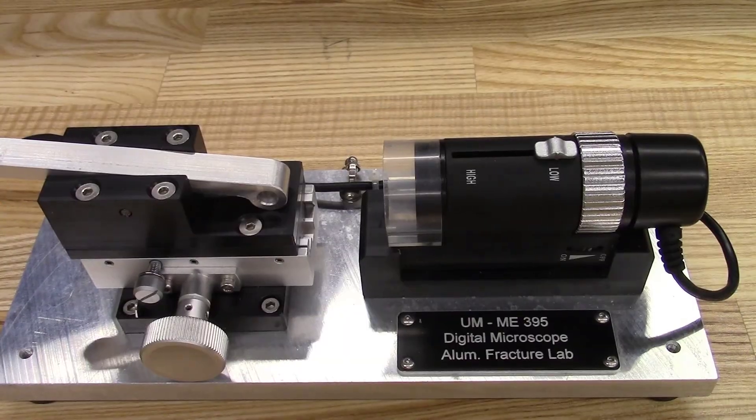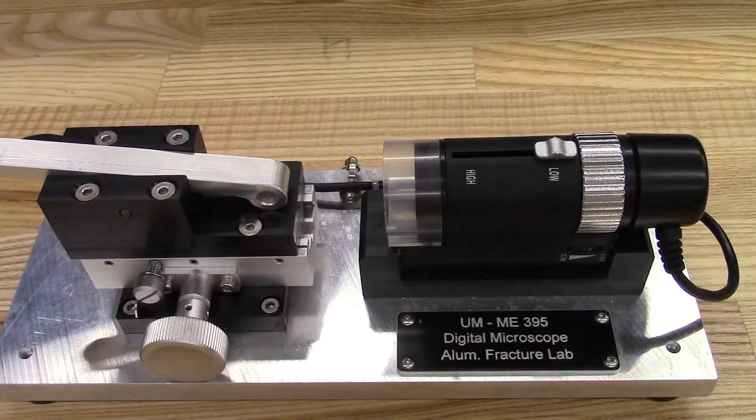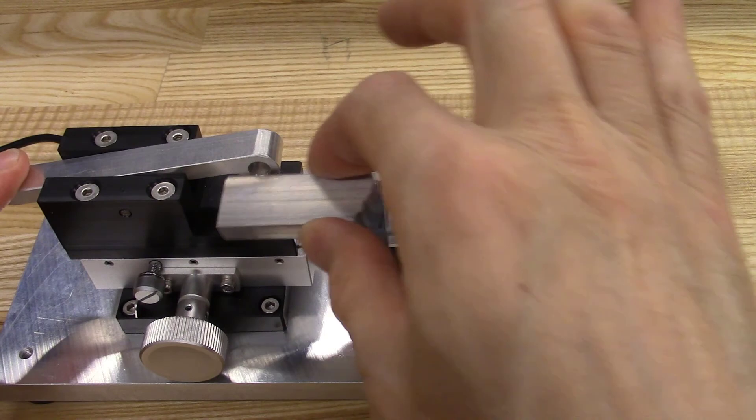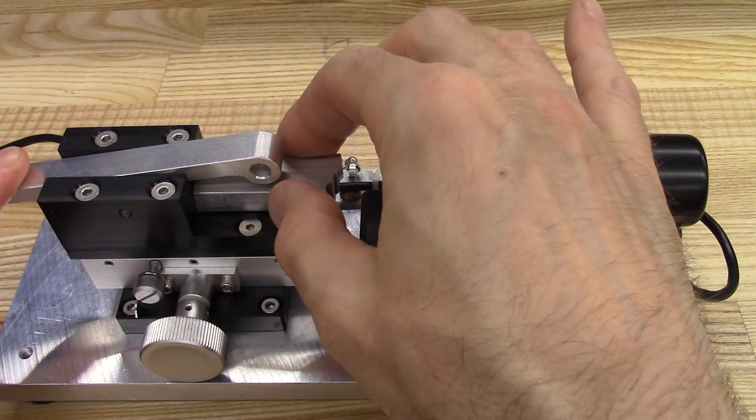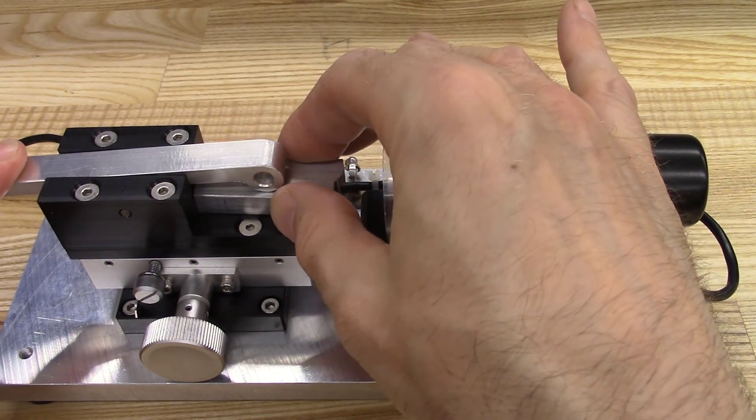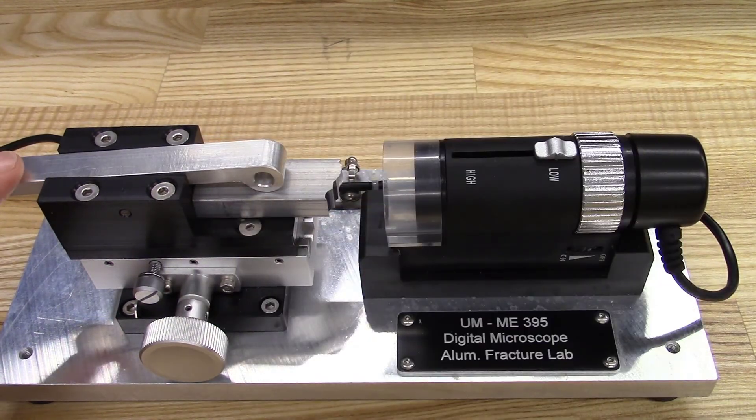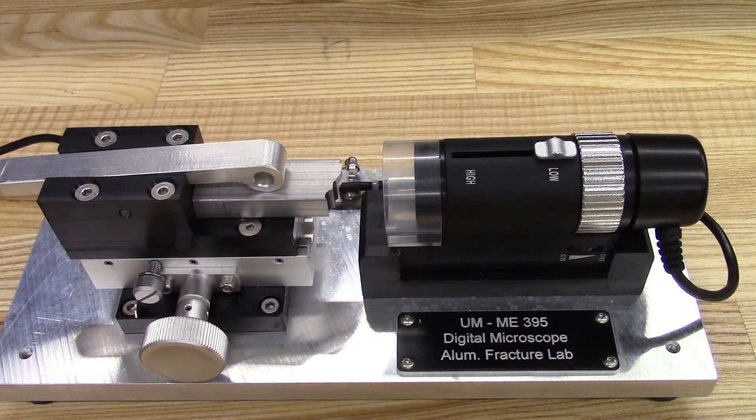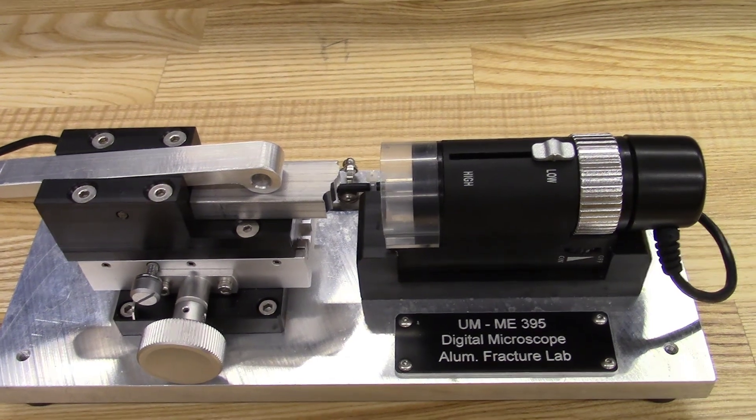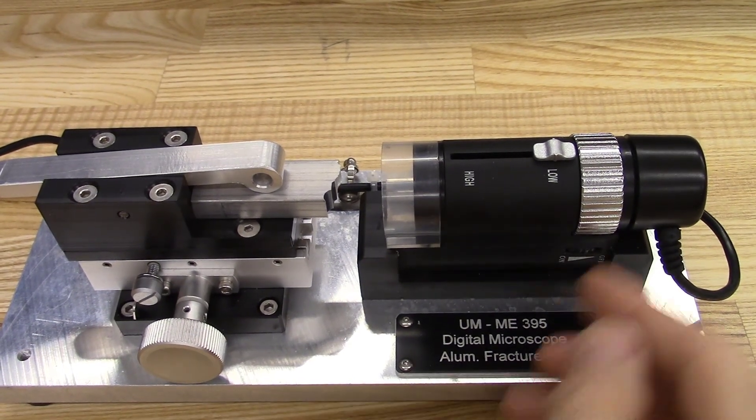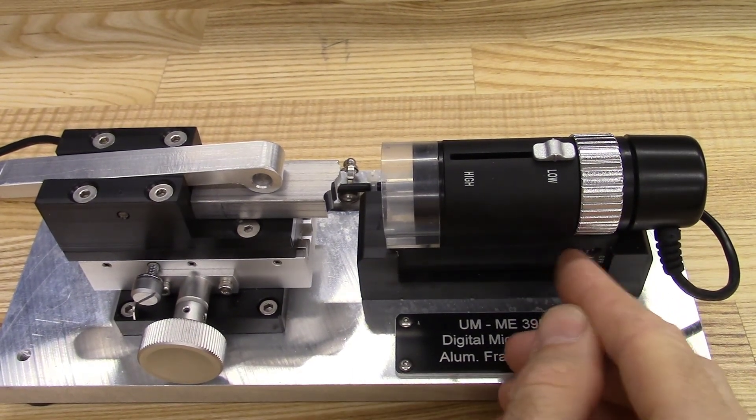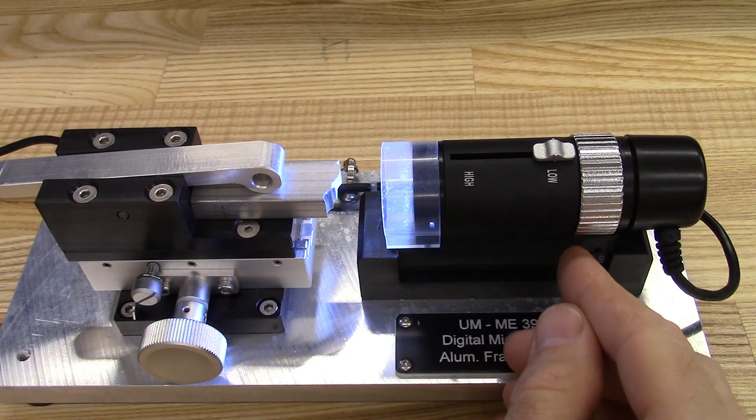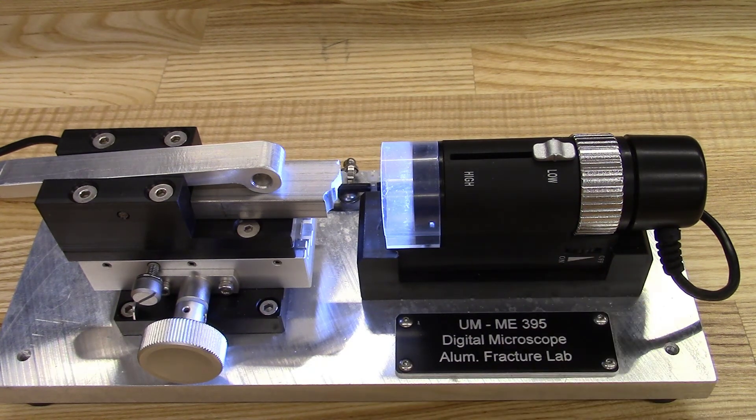Mount a fractured fatigue specimen onto the stage under the spring-loaded clamp. The specimen should be roughly centered and in line with the camera. Turn on the LED lighting using the dial at the base of the camera.